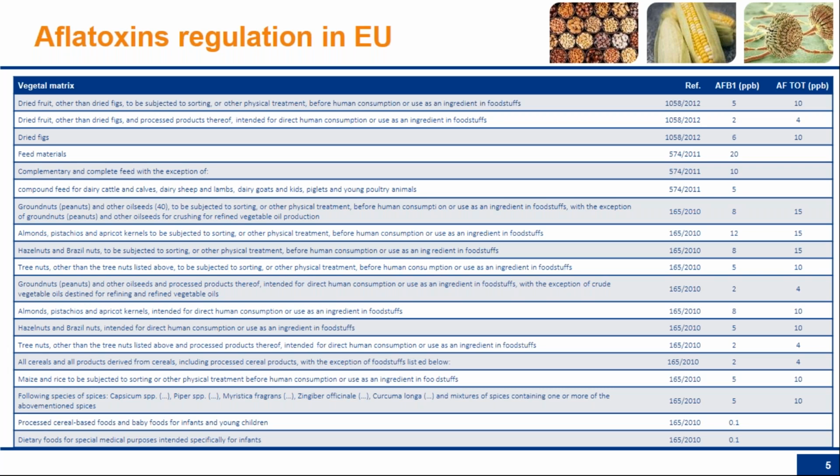Sometimes they put G1 as abundant as B1, or G1 equal to B2 and G2 in relevant concentration. And this is done indeed to challenge the analytical methods for all aflatoxins, to determine all the forms despite their natural proportion in routine samples. So the point is we cannot stay 100% confident that B1 is sufficient and is the only parameter to have analyzed.